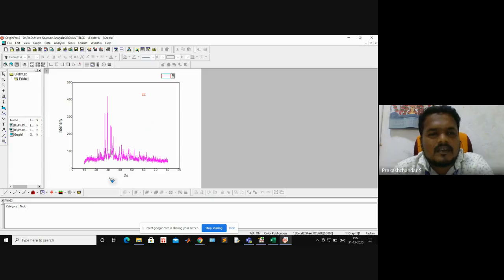So like this, and then here, click here. This is CaCO3, CaCO3.